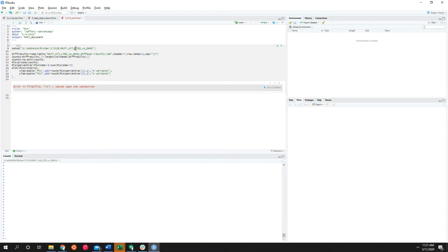So today I'm just going to be working with this data set up here. It's an RNA-seq run comparing different mutants with or without estrogen, for extremely long time points. If you want to get to this, you just replace everything with the U dots with the Gertz group 2. That's my folder in Gertz group 2, and you should be able to get to it there. So without further ado, let's get in here.